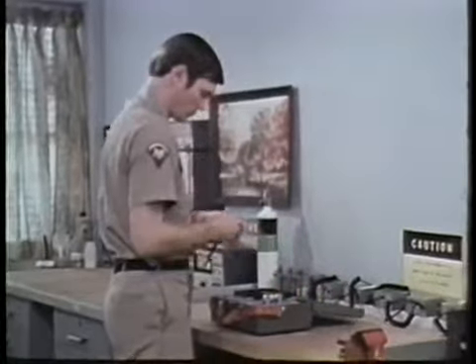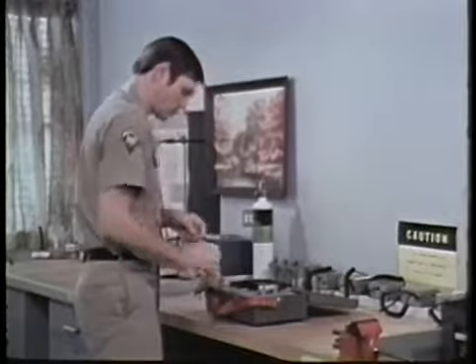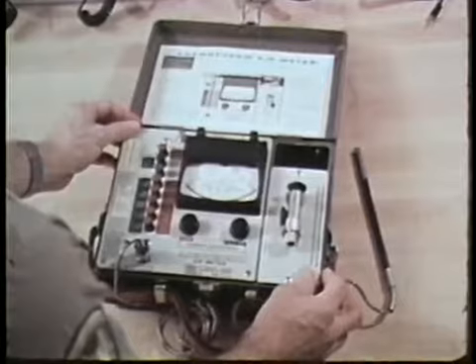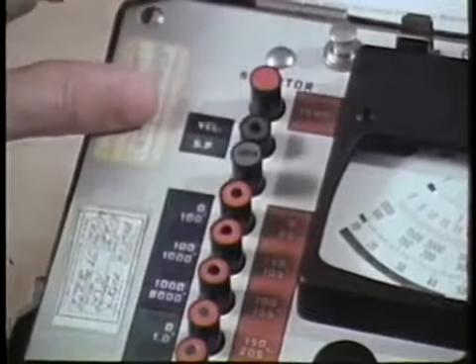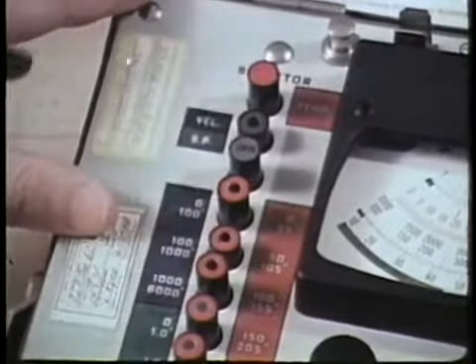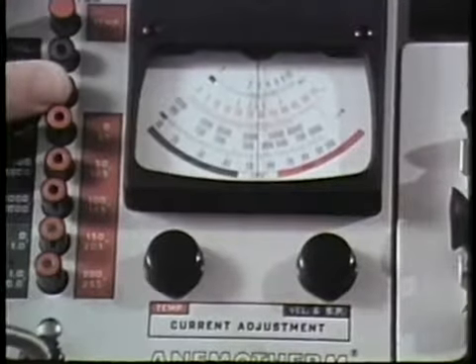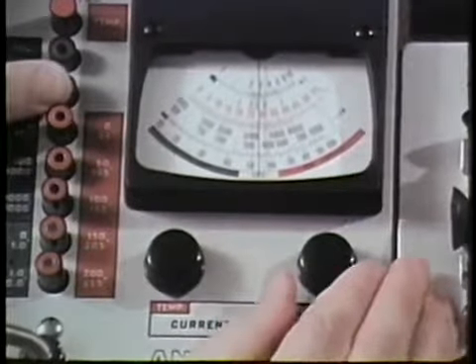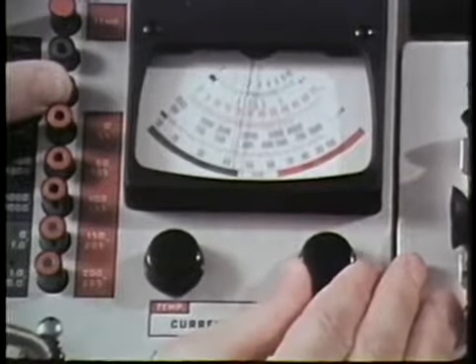First, the anemometer, or air velocity meter. To adjust the calibration, select the velocity and static pressure mode and the 100 to 1000 scale. Then hold down the check button. The needle should swing and stop exactly over the red calibration mark. If it doesn't, correct it with the current adjustment knob, the one associated with velocity and static pressure mode.